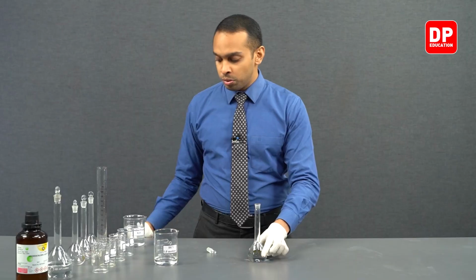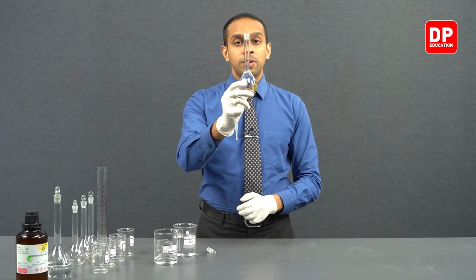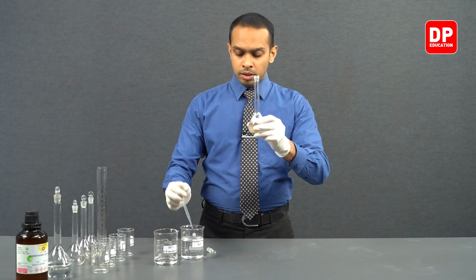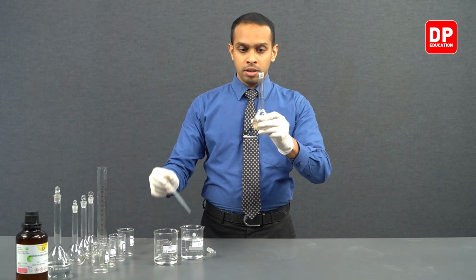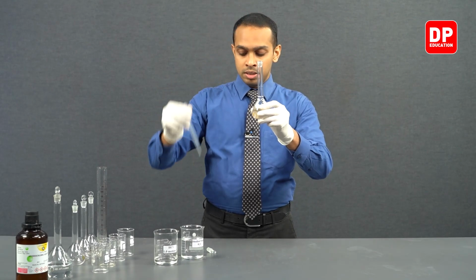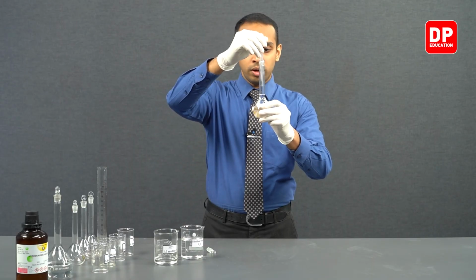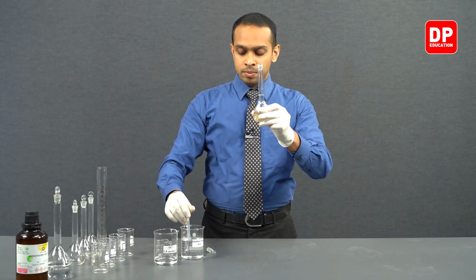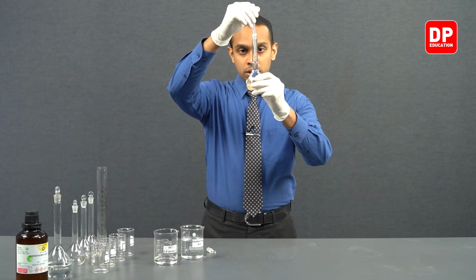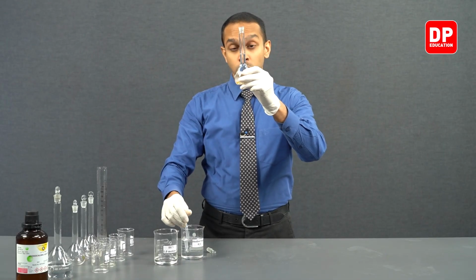Then we can move on to adding more water to this volumetric flask with the use of a dropper. Since we have already reached the narrow part of our volumetric flask, it is wise to use a dropper at this point. If you make a mistake now, you will have to start preparing this solution all over again.